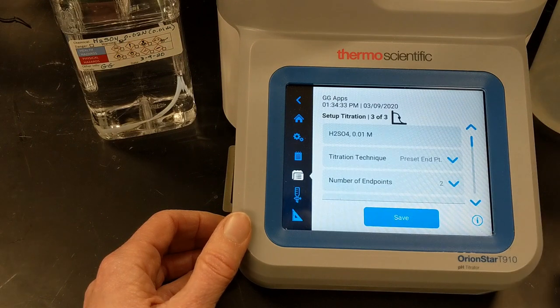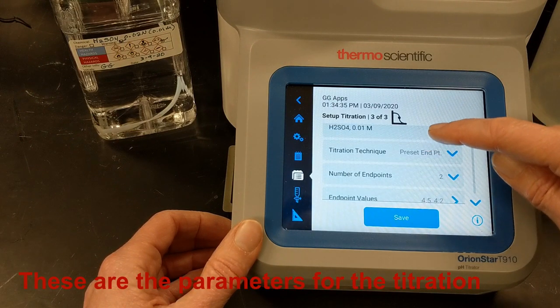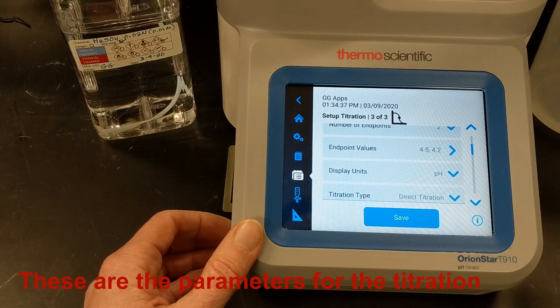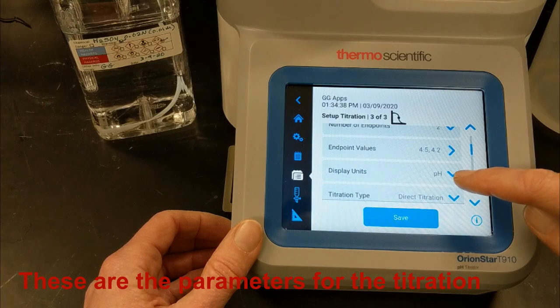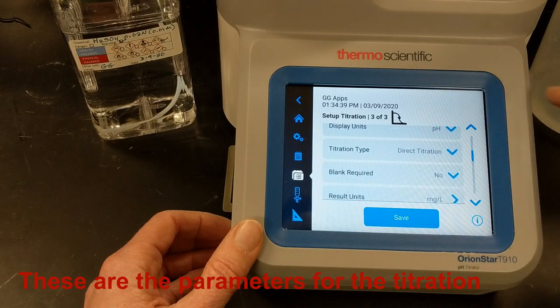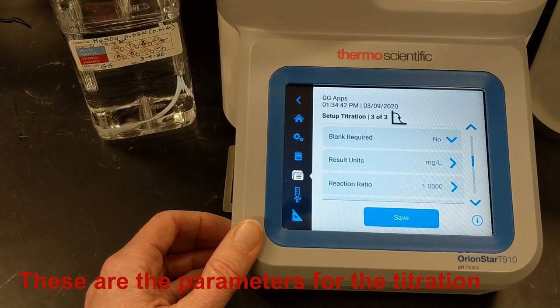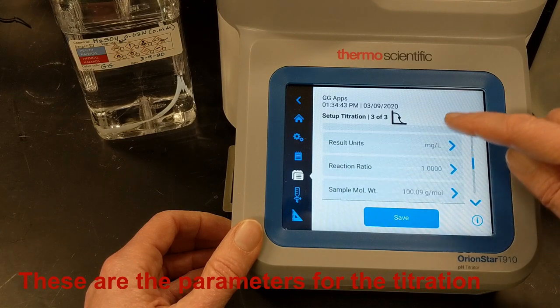I'm using the preset endpoint technique and have chosen two endpoints at pH 4.5 and pH 4.2 to comply with standard methods 2320 low-level alkalinity procedure. The signal display units are pH, and this is a direct titration with no blank required. My results will be in milligrams per liter as calcium carbonate. The reaction ratio between calcium carbonate and sulfuric acid is 1.